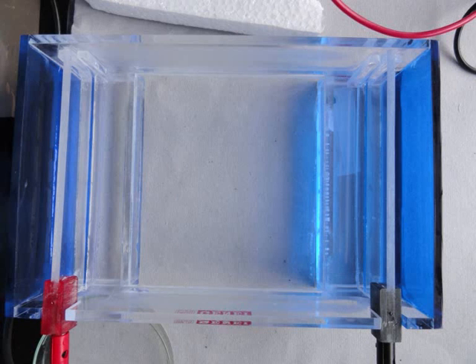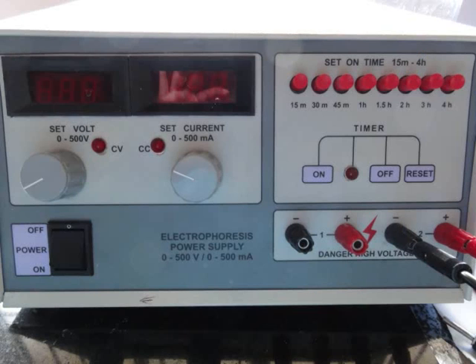These products are then run on an agarose gel to measure the purity and to view the final results of our experiments.